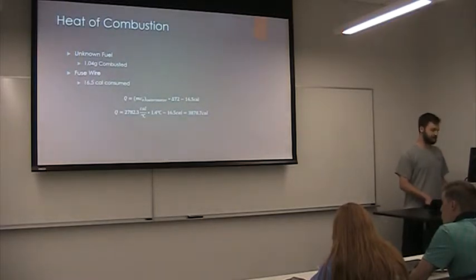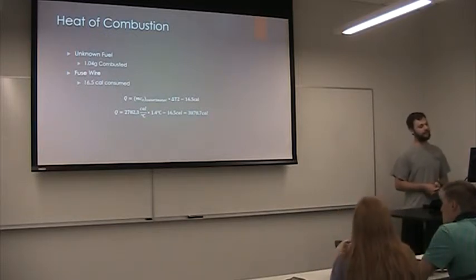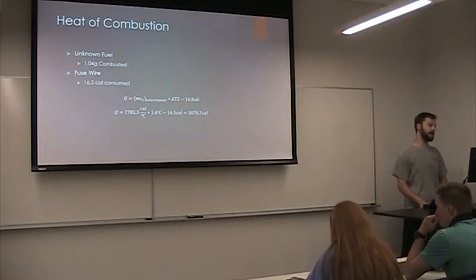For the heat of combustion, the unknown fuel had, as I said before, 1.04 grams combusted. Plugging that all into our equation and using our thermal capacitance number, we got a heat of combustion of about 3,800 calories.